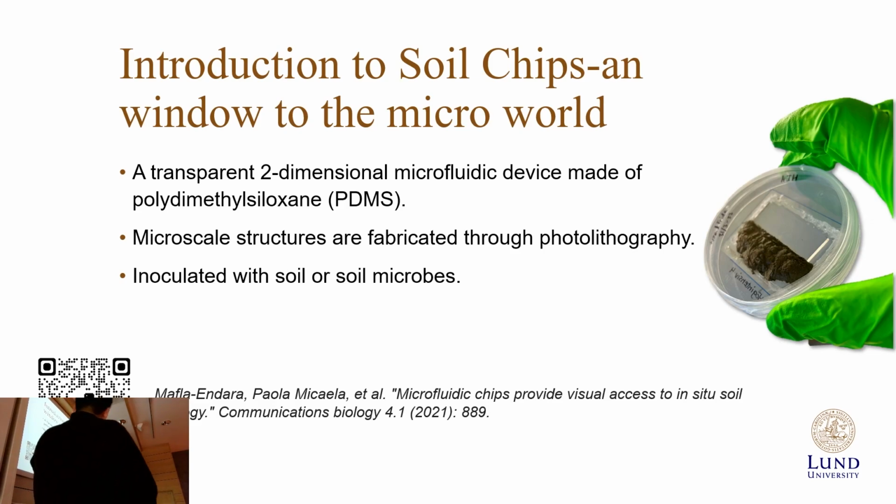So we built this microfluidic device, which is made of PDMS, transparent silicon, using a method called photolithography, similar to how you make computer chips. Inside those tiny chips, we can construct microscale features, structures like a maze, and then we inoculate fungi.